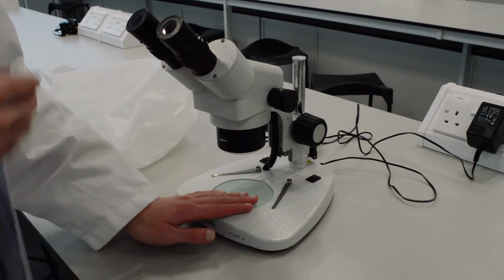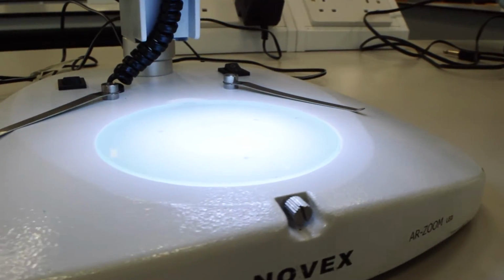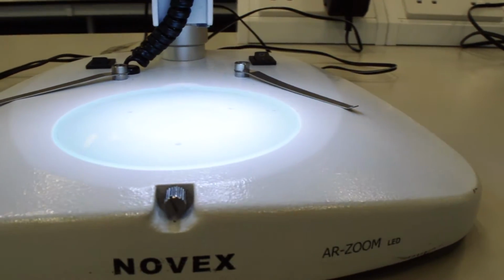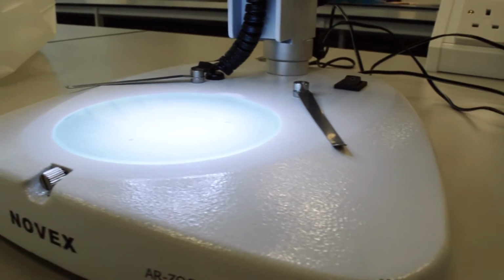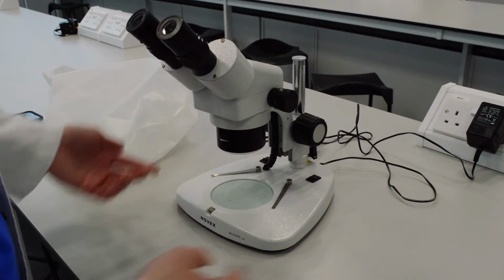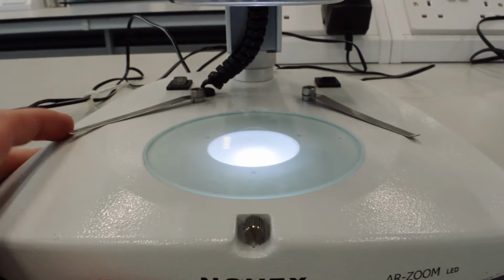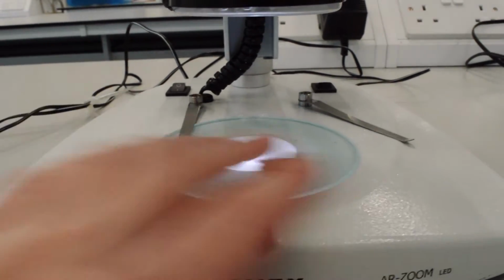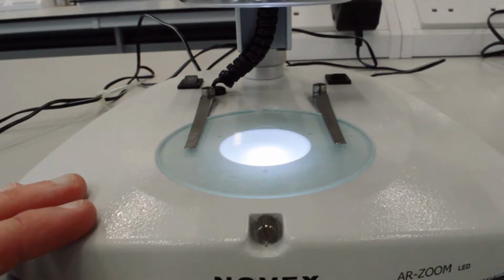The area that you place your organism on is called the stage. In this case, it's nice and large so you can put like a tray or a dish on there and see organisms that have been preserved or they're being kept in ethanol or something along those lines. You have two clips. If you have an organism that's being kept on a tile, you can hold the tile in place using those two metal prongs, which is quite nice.